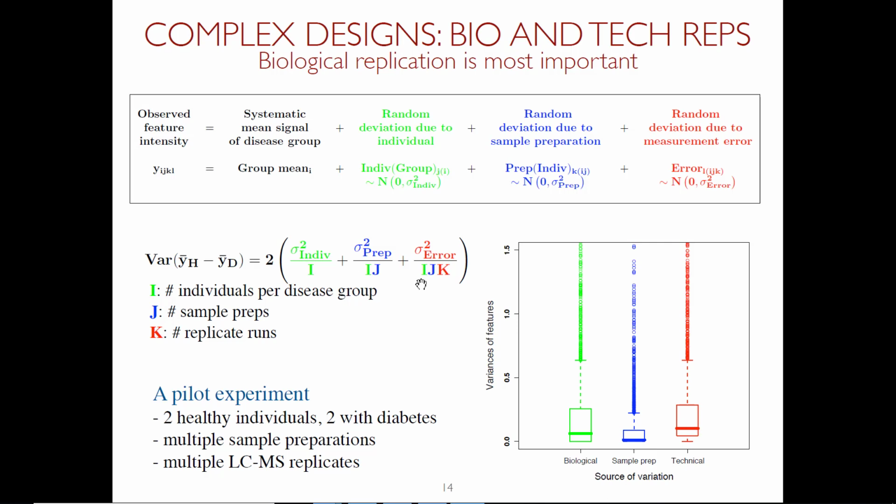So this is how we think about different designs. And so when you come to us saying, okay, should I design it like this or like that, right? This is what's going on in our mind. We'll actually ask what is the variation associated with these designs, what would be the ways to reduce it, and what are the most effective ways to reduce it. Could you maybe comment on the necessity of having technical injection replicates based on whether you do DIA or DDA or TMT? Because I can imagine that the variance is different there.